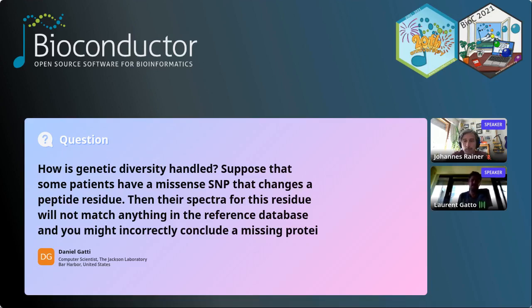The name will have to be changed because the PSM name already exists in a CRAN package that has been orphaned or removed from CRAN for a couple of years now, but it's already taken. Again, this is something that you would handle way before analyzing your data, when you plan your experiment. I hope this answers the question.